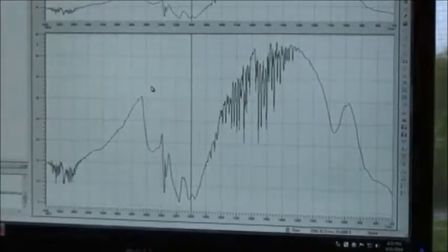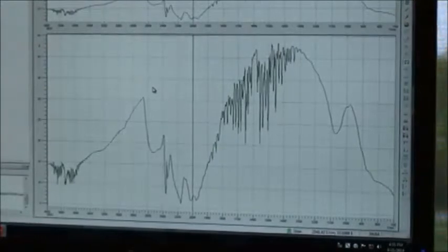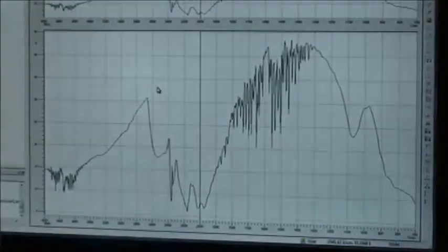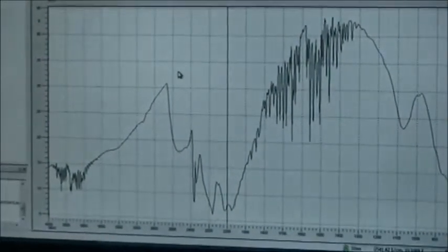Okay, now that our instrument has already run in the background, this is our spectra for our background. So this is going to be subtracted from the sample that we put on.